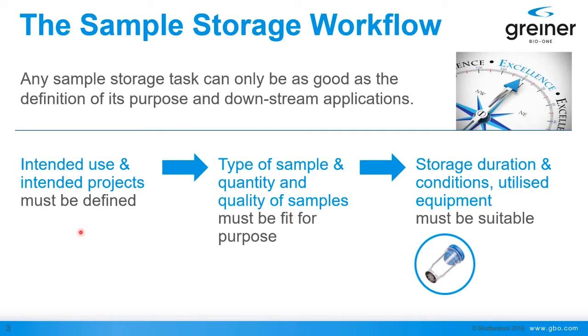And this brings us to intended use statements concerning your biobanking or sample storage approach, and also the intended project you actually want to carry out. This sometimes starts a little bit at the end of the workflow, where we wonder ourselves, what actually will we do with the samples at the end? Who will be the scientists who take advantage of the samples and do their research with these samples? How will they be shipped, and what will happen to them?